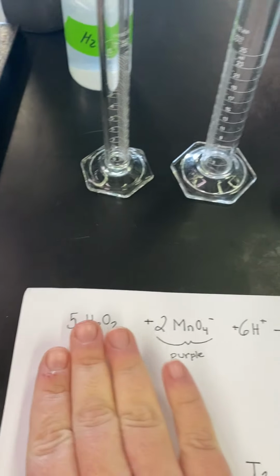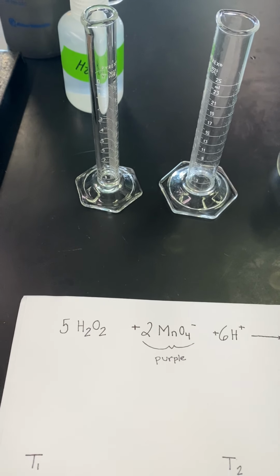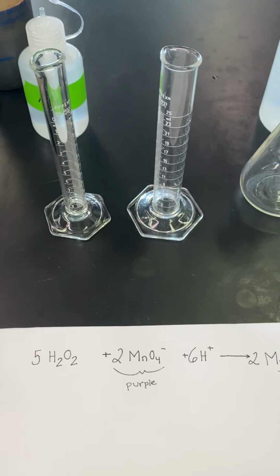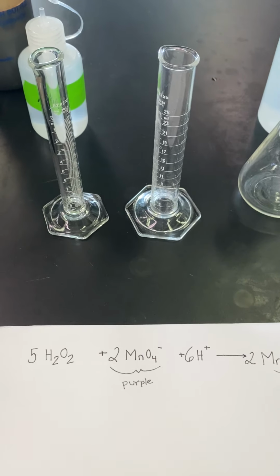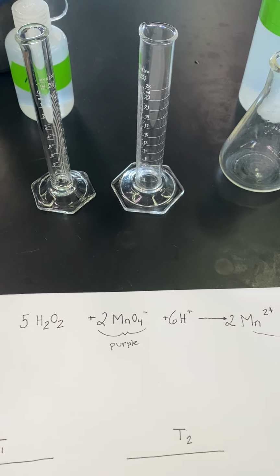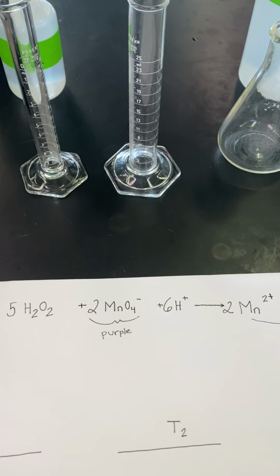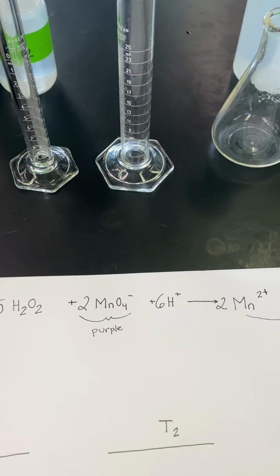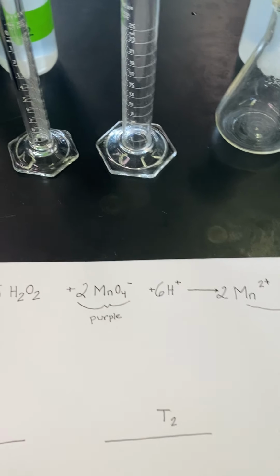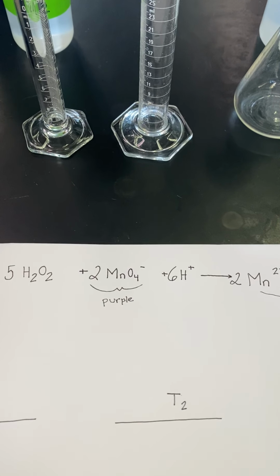As soon as we've completely consumed our hydrogen peroxide, that purple color will remain. Okay, so once we see the purple color remain, we know we have consumed all of the hydrogen peroxide and we have reached our endpoint of the titration. Okay, so it's very similar to when you did the vinegar lab, where you titrated until you reached the endpoint where you consumed all of the vinegar and the pink color from the phenolphthalein remained.